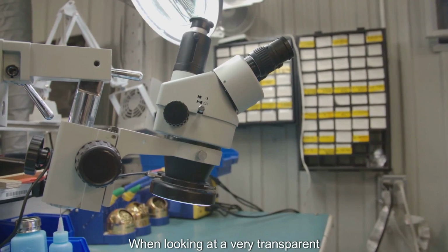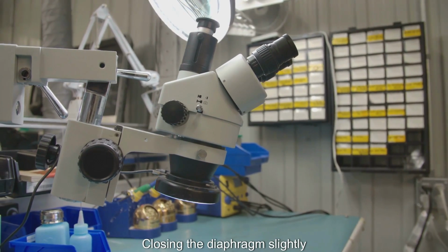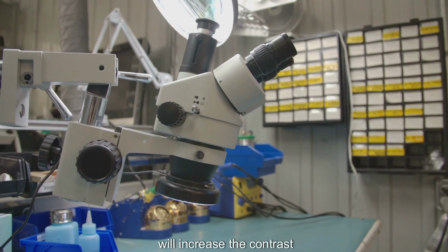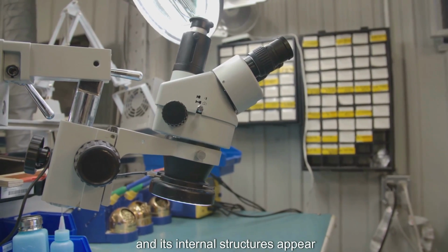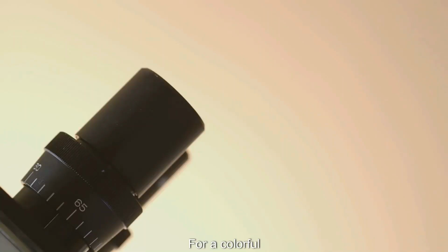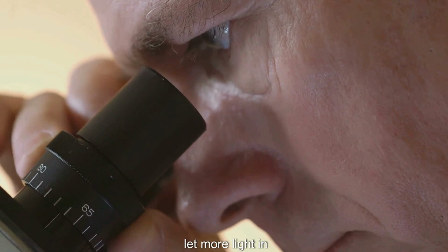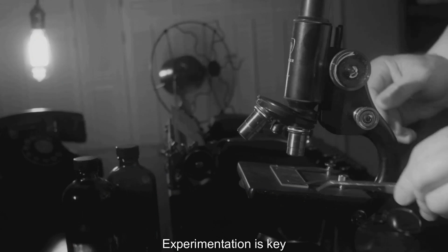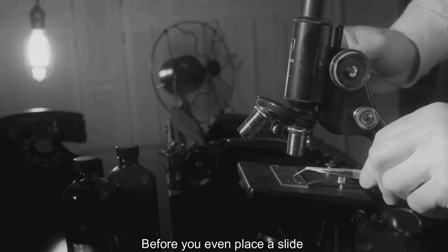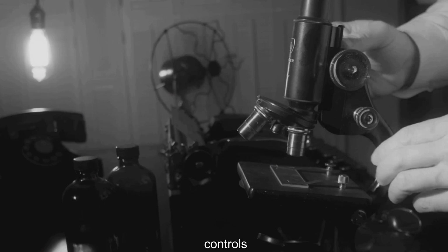When looking at a very transparent, unstained specimen, closing the diaphragm slightly will increase the contrast. This makes the edges of the cell and its internal structures appear much more defined. For a colorful, stained specimen, you might open the diaphragm to let more light in. That makes the colors appear brighter. Experimentation is key. Before you even place a slide on the stage, take a moment to play with these controls.